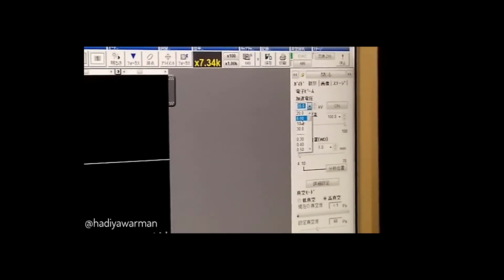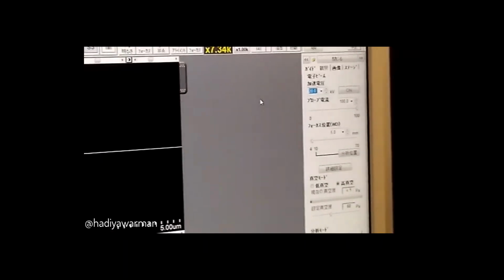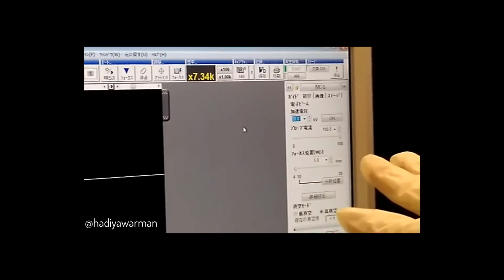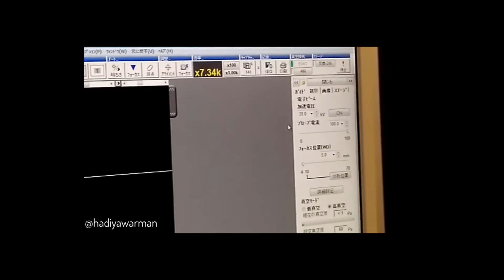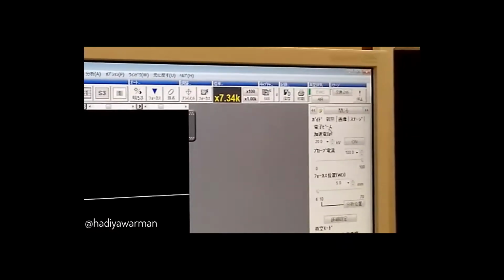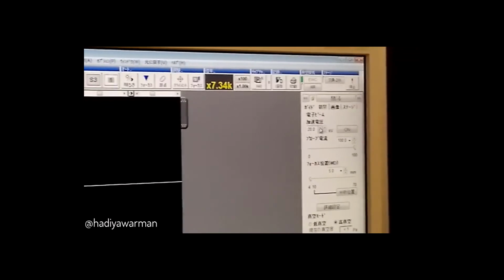Oh, fine image. So lower becomes finer, but it becomes dark. You have to get a clear image. It becomes fine but darker. So usually we use 20 in the first time, and if the image quality is not good, you can change it.